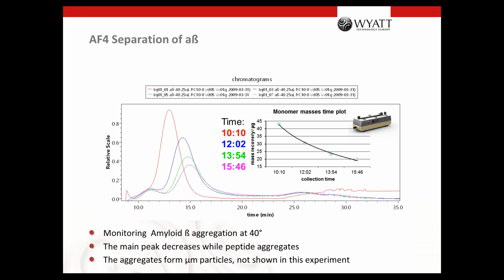And then the particle has more repulsion or more attraction, and is higher in the flow velocity profile in the channel. And then you have different retention times. So the temperature is not the case here. I'm definitely sure that it's something else. Maybe the membrane is changing due to the aggregates.